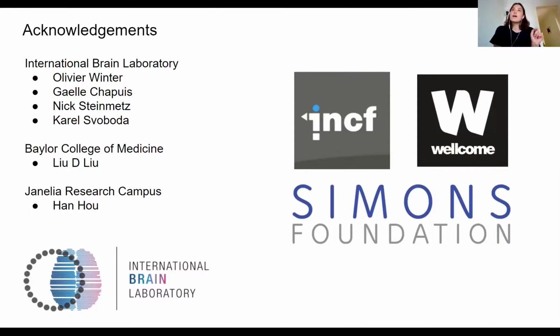One thing that we did notice was that if you're going to do reassigning and merging, it's best to do that within the Kilosort output files and do that first, and then convert. No, sorry, the other way around. I need to find out, but one needed to be done first in order for it to still be compatible. So I'll confirm on the Slack channel about that.